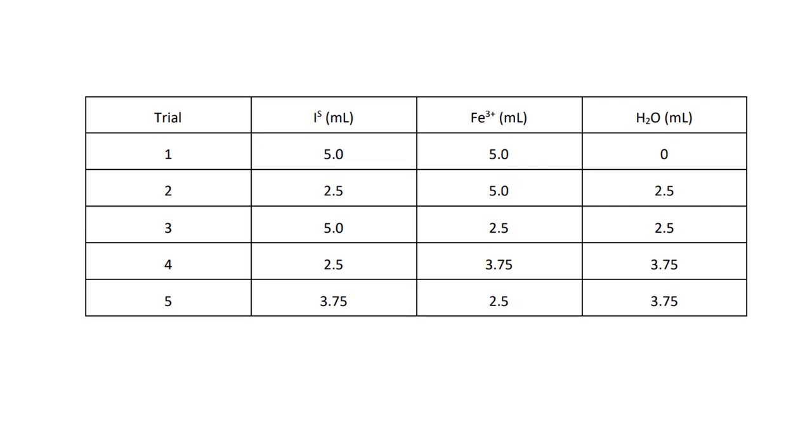So let's talk about, once you obtain that data, and your lab handout walks you through how to set up your colorimeter and how to set up the LabQuest, and then how to prepare your solutions. So let's talk about what you are going to do with that data.